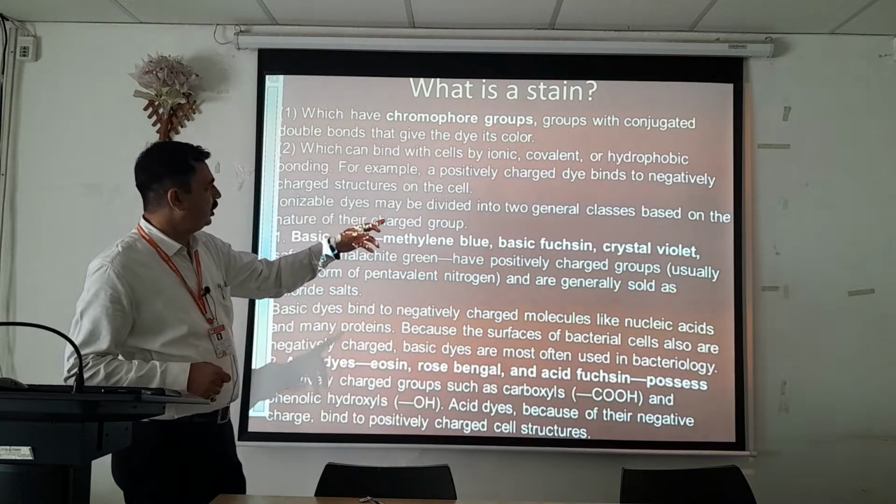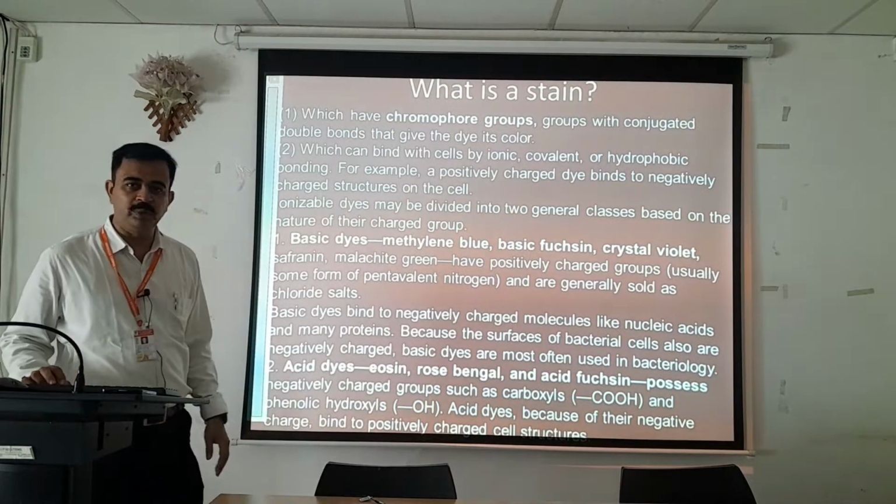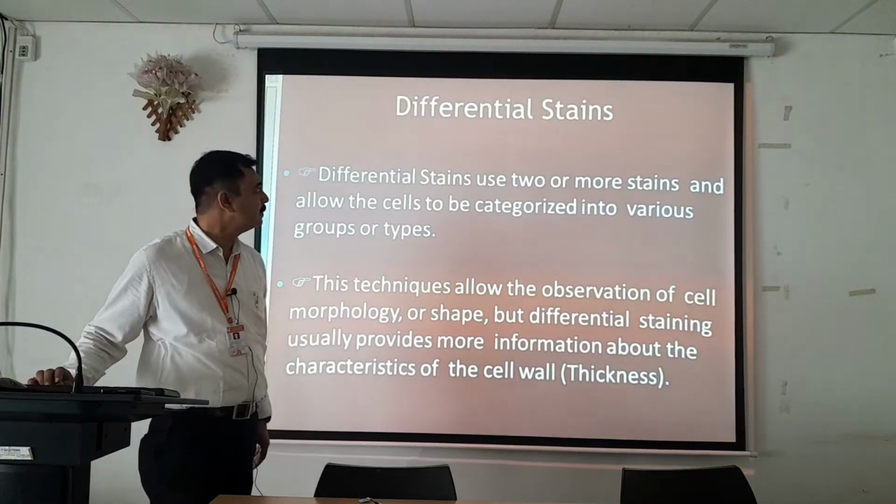So dyes are divided into two categories: basic dyes and acidic dyes. We have already seen this part, so I won't go into detail again.